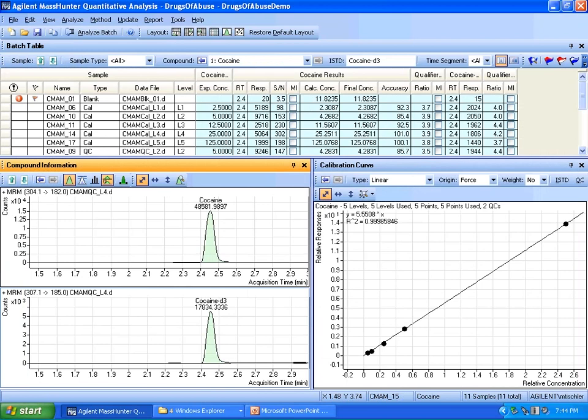In terms of nomenclature, if you are willing to assume that another compound of the same class has the same response factor as your target, with relative ISTD, you can assign that other compound as the target's ISTD, and relative ISTD will calculate a concentration relative to the known ISTD concentration. This is the origin of the term semiquant.